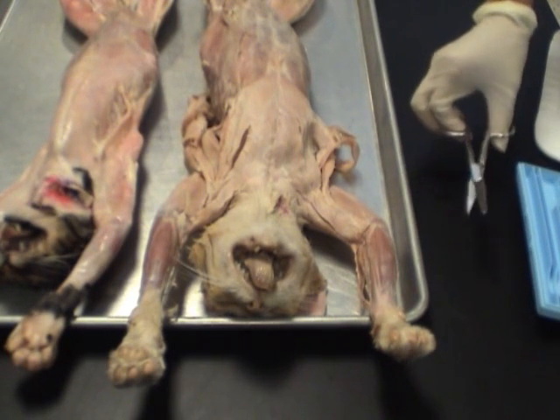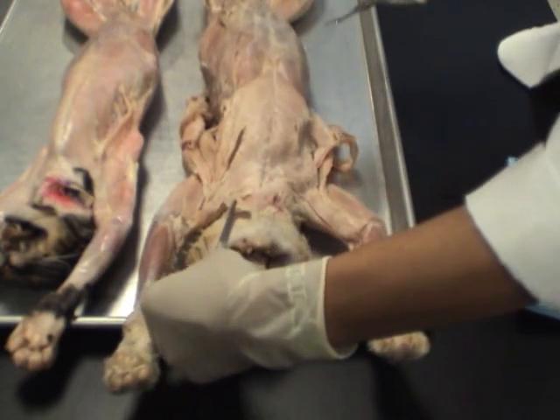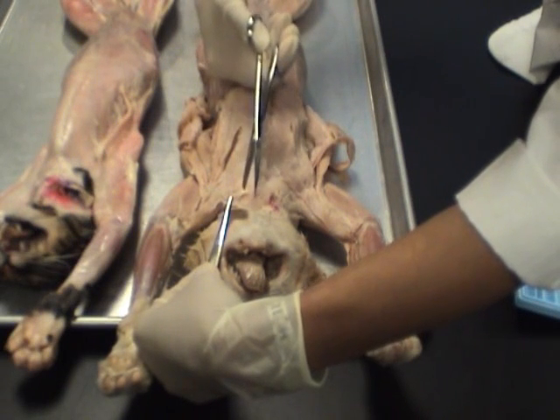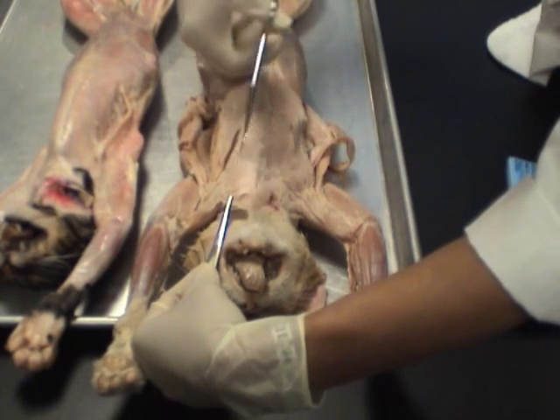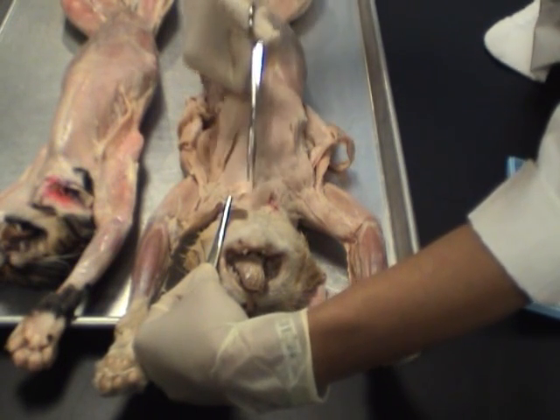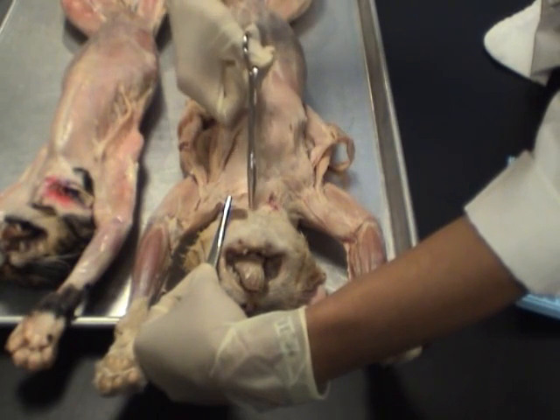For example, let's go to this cat, and I'm going to use the pickup to reflect the skin. If I was to cut, I will not go down this way because the blunt end is up, the sharp end is down, and I don't want that because I might accidentally cut through the muscle. What I want to do is hold the scissor this way with the blunt end of the scissor down so that it won't pierce or cut anything by mistake. So always cut with the pair of scissors with the blunt end down.